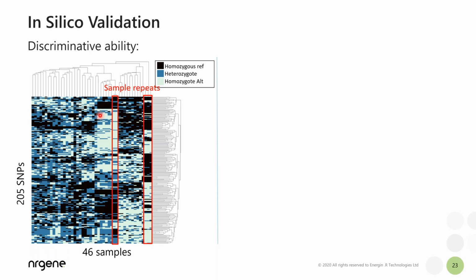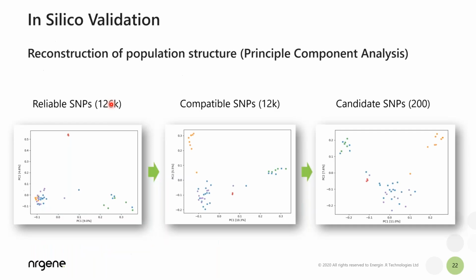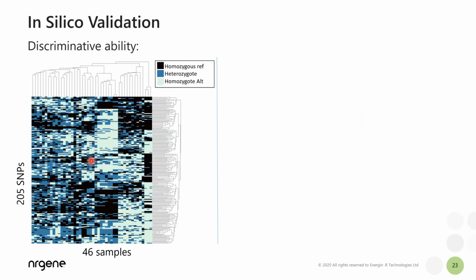Another interesting thing about those two samples is that they belong to a clade of samples, all the orange ones here, that are very much different from the other samples and are more similar to one another. This is the thing that you would expect when looking at different breeding material, and we've actually seen that in many species, that these types of genome-wide analysis confirm things that people know to be true by pedigree information and other types of information.